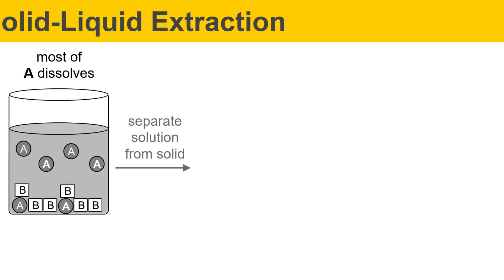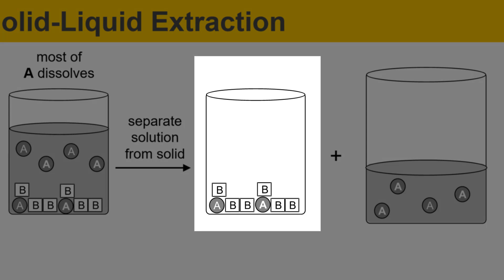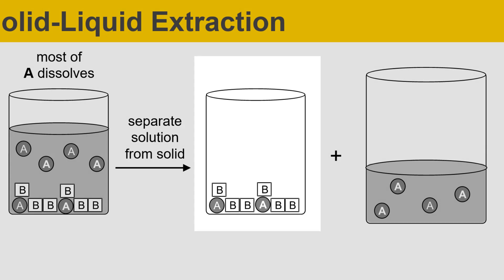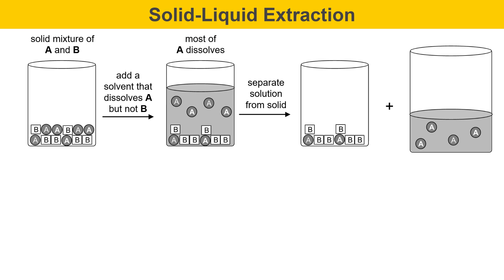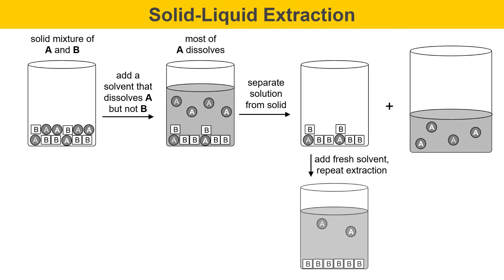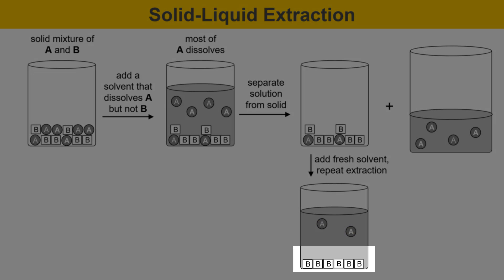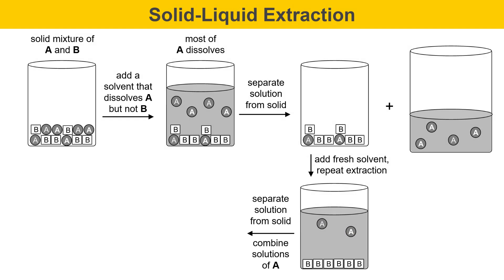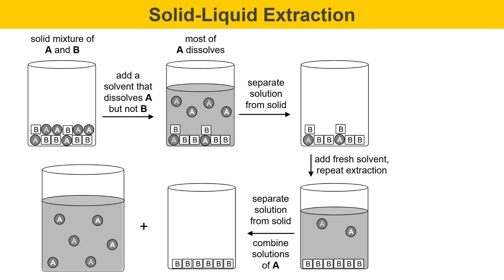Then we need to separate the solution from the solid. We can do that by filtration or simply pouring off the liquid solution, giving us two materials: a beaker on the left containing the residue — mostly B with a little bit of A — and a beaker on the right containing a filtered solution of A. Now I'm going to do another extraction of the solid residue to recover more of the A material. I'll add a fresh portion of solvent, swirl it around, and hopefully most of the remaining A dissolves. Then I'll separate the solution from the solid, giving me a residue of solid B and a solution of A, which I'll combine with the previous solution. Now I have two containers: one with the solution of A, the other with solid B — the materials have been separated.